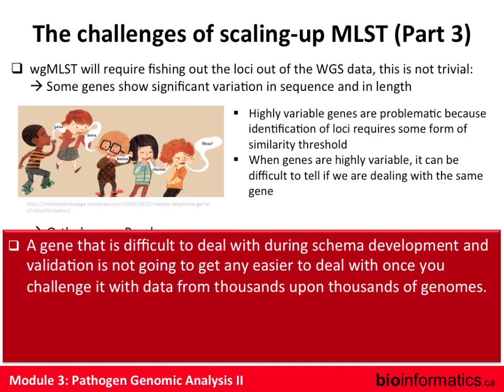There's no sense keeping it around in your scheme, because it's just going to give you more trouble, especially since we have data sets of thousands of genomes now. There's a lot of mischief that can happen in evolution. We're dealing with biology, and biology is inherently noisy. If you have a penchant for keeping around things that are biologically noisy, it's going to come back and bite you hugely. As someone famous has said, hugely, bigly.